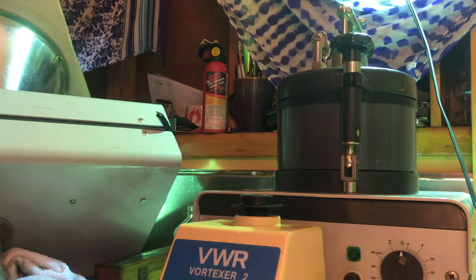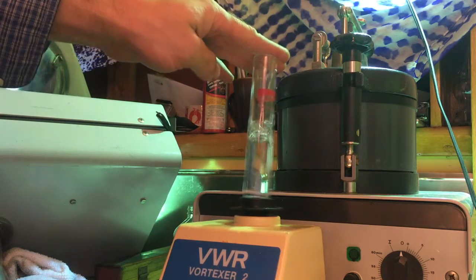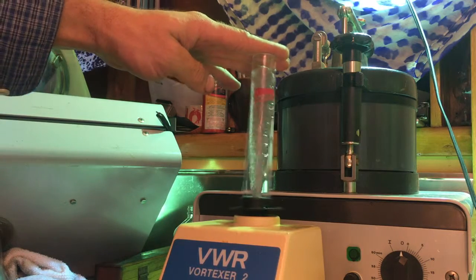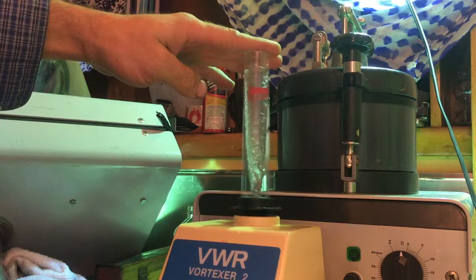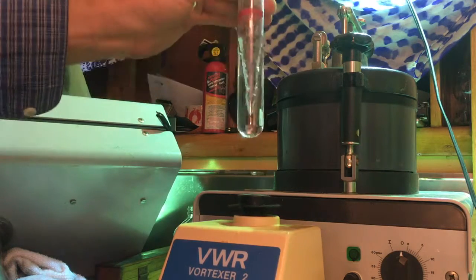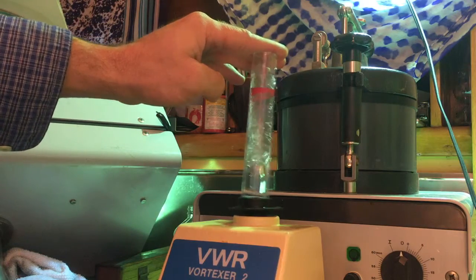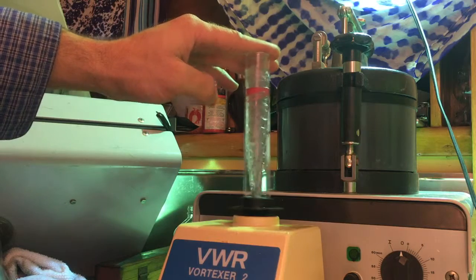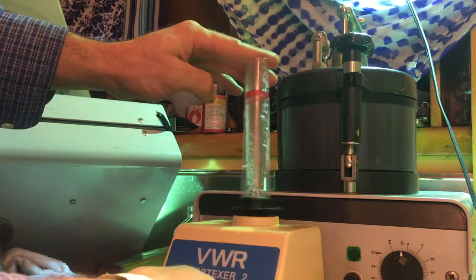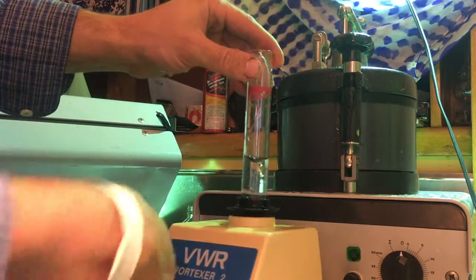Beaker of water — wow, look at that vortex! That is a serious vortex. I had it on too high before and it'll shoot out the top. Yeah, there we go — you can see it overflow if you're not careful.